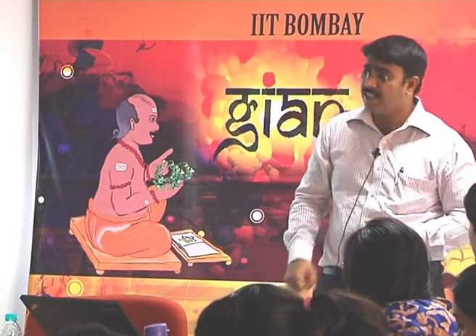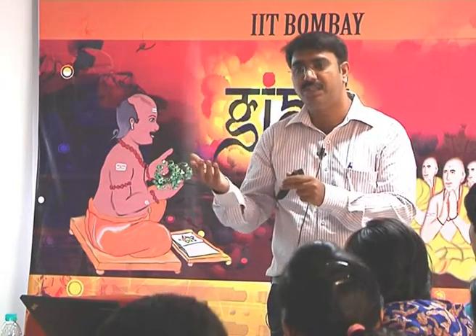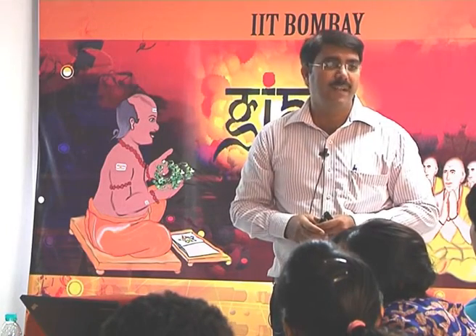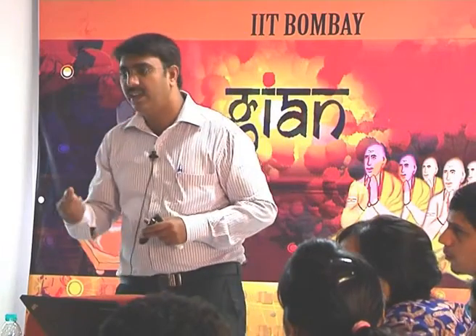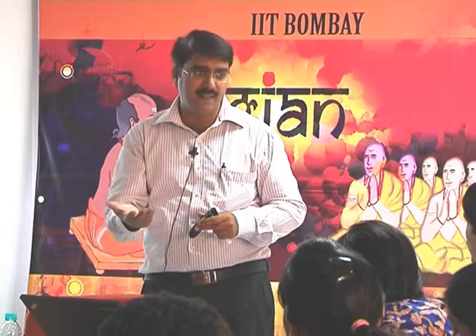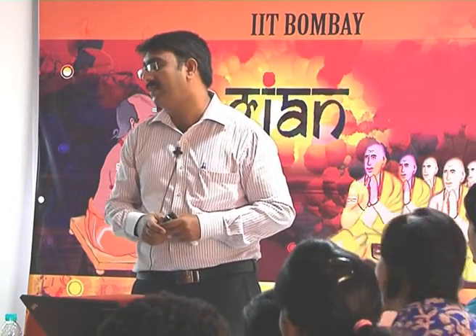Price wise, if I compare SPR chips versus these biosensors, one sensor costs you something like $5, and you can regenerate this sensor. I perform the regeneration instructions, regenerate the surface, and use it next time. At least these sensors we can use 10 times.